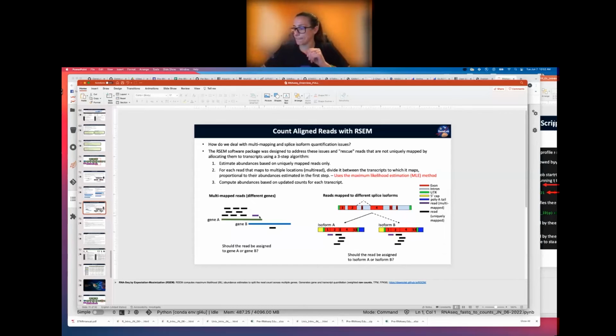Okay, great. So if we would use one of those quantitation methods that doesn't do a weighted quantitation and just throws away all of the multi-mapped reads, or just counts all the multi-mapped reads as one, then you wouldn't end up with any decimals. But because we use RSEM with the maximum likelihood estimation, you will see some of those raw count values, or those expected count values, with decimals because of that.